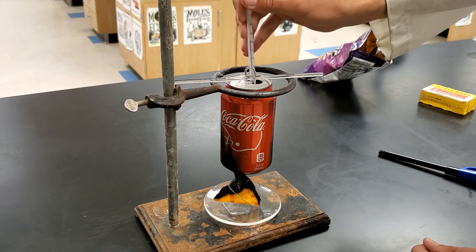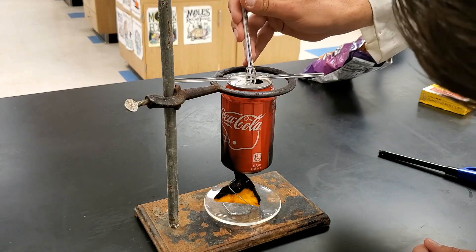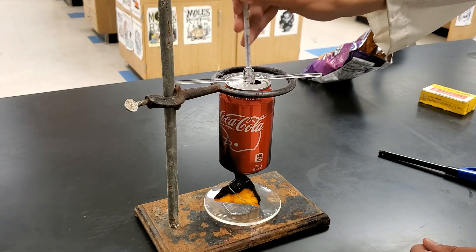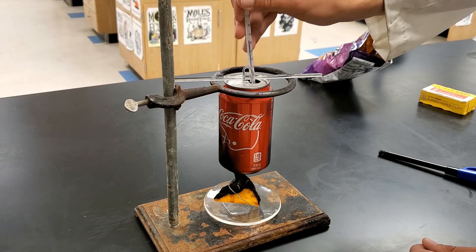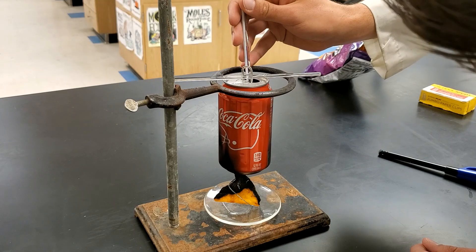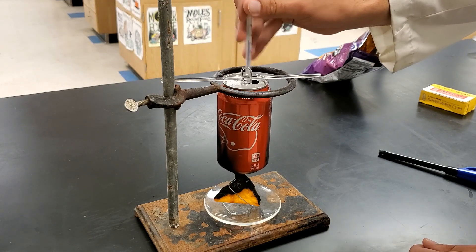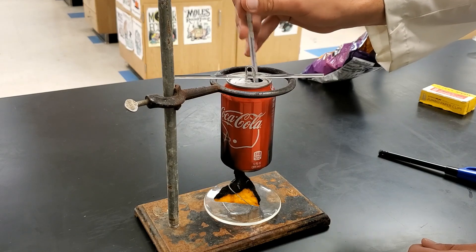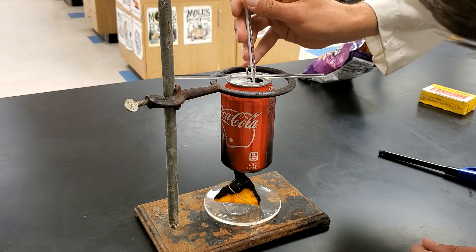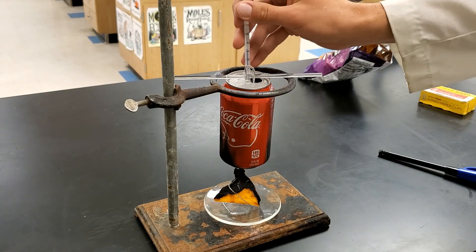I'm going to continue to stir and take a look at my temperature. Right now it's looking at about 42.2. I don't know that it's going to heat up much more. That's more like 42.7 or 42.8 now — I'm going to keep stirring, because sometimes that heat needs to be distributed. Remember, we're recording the max temperature it reaches. It looks like it's starting to go down a little bit, so we're going to keep that 42.7 number.